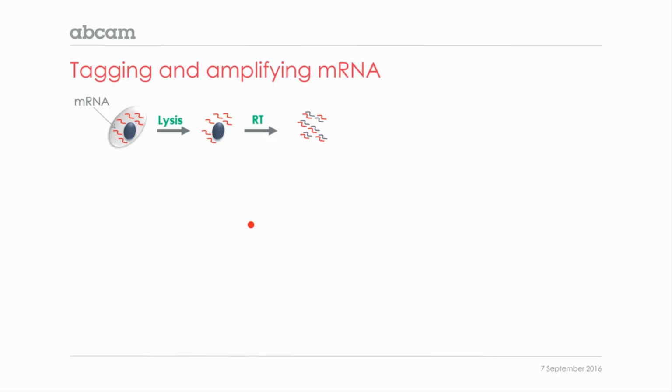Now, one of the main key features of this protocol that I'm describing for single-cell RNA sequencing is the idea of tagging the molecules before we amplify them. So remember, again, the first step is basically similar. We break the cells, we get the RNA, and then we reverse transcribe it. But now I will zoom in on one particular RNA molecule, and we mostly work with polyadenylated RNA, and we'll explain the process. So in the mix, we have a reverse transcription primer, which is a poly-T primer with a known tail on the 5'.